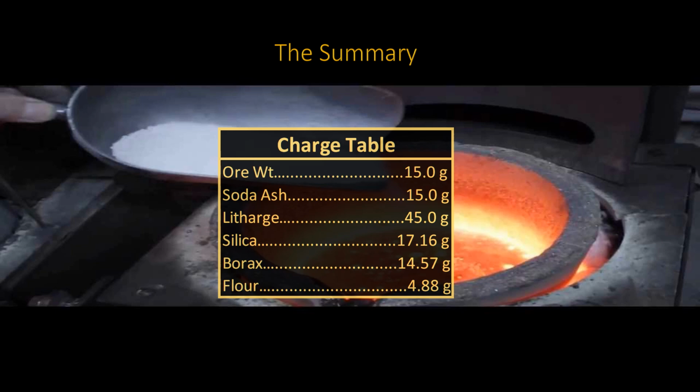Since this is a Class III ore case example, it did not contain any silicates and was basically a high oxide ore. Niter was not required and flour was added to reduce the litharge to elemental lead. Therefore, additional soda ash was not required. As there were no contaminants present, no additional requirements were necessary that would have been listed in Step 9. All that is needed is to place the results into a charge table.